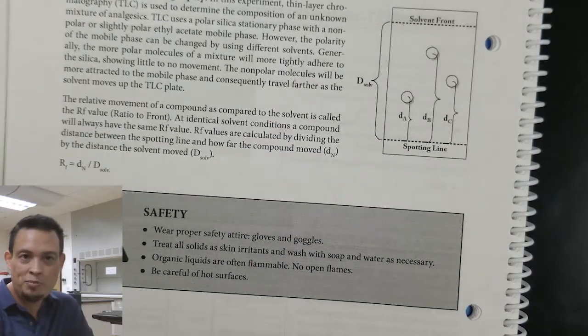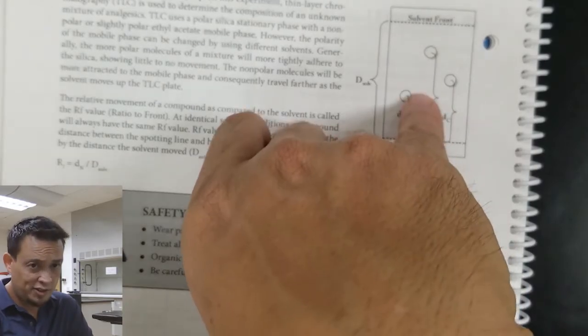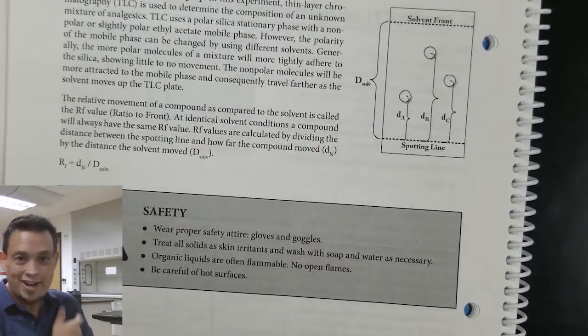It's quick and crude, but honestly, we typically don't use TLC for this purpose. In my experience, TLC is used for reaction analysis. We'll actually see next semester in Chem 242 that you can track the formation of a product over time as the spot becomes more pronounced on the TLC plate. But that's a story for another time. Okay, let's go ahead and go to the experiment now and see how this all works.